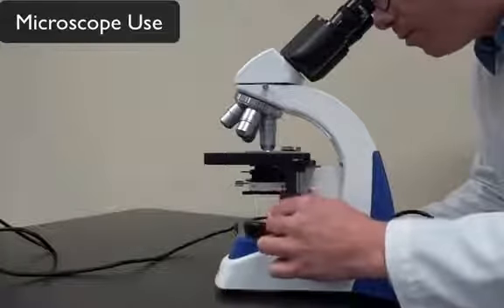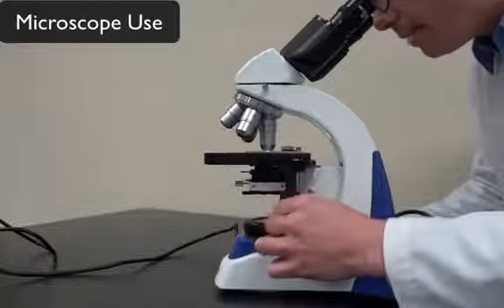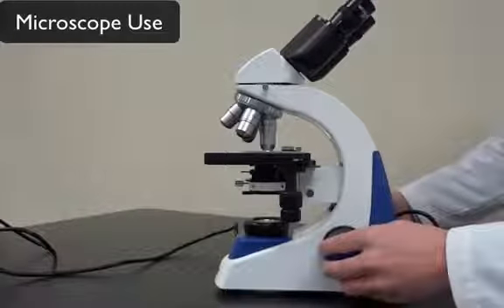I don't get as wide a view, but I can still cruise around and take a look at the different parts of the specimen. Now let's say I lose focus in high power. Something happens, and I can't get it in focus with the fine tuner.